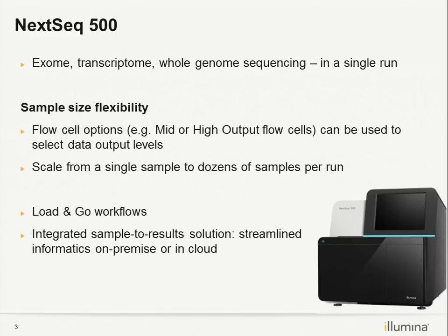What you do is copy your run data, the base call files, and then you generate a sample sheet. To generate a sample sheet, you can use our free software called IEM. The sample sheet states your sample number, your sample name, and the index used for that sample.